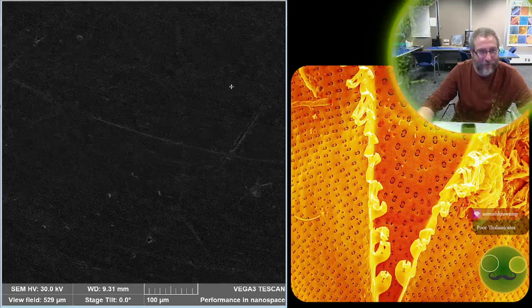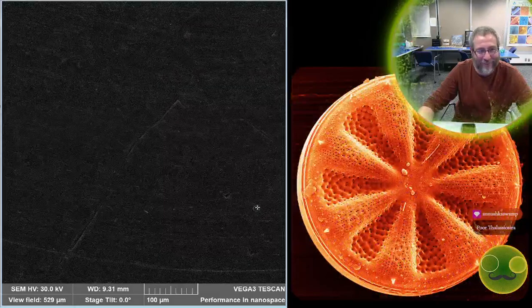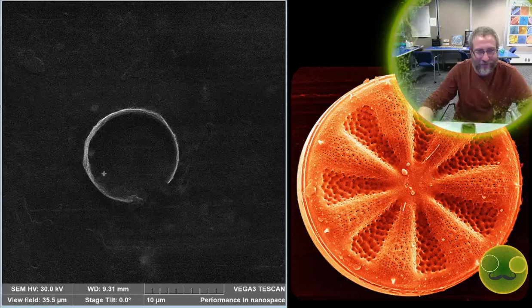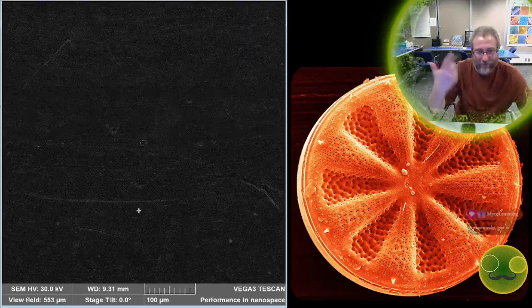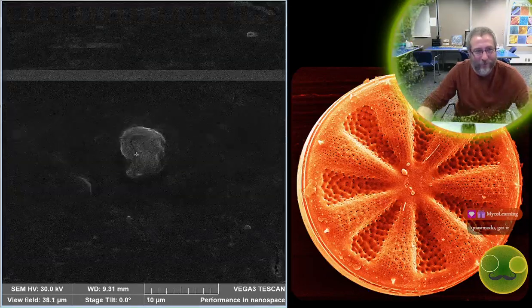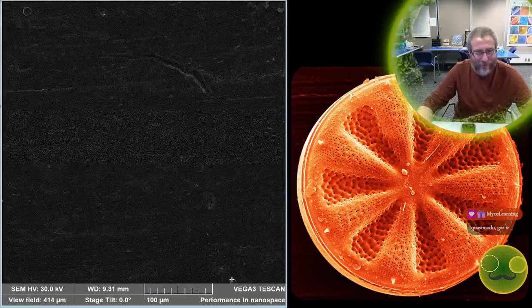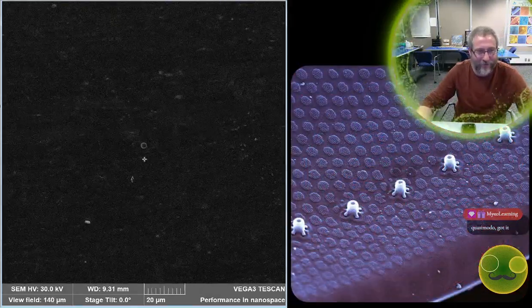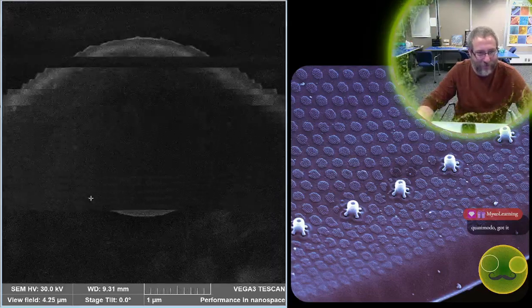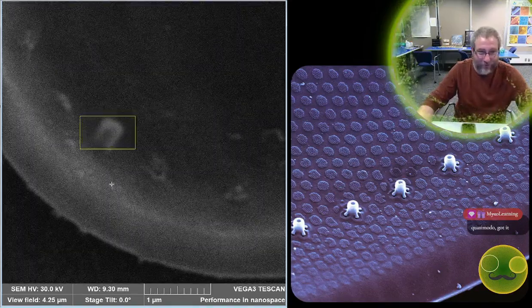Circus freak diatoms are kind of interesting to find, but I don't think that we want to use them to characterize anything. This is just a girdle band, so it's the part that wraps around the outside there. And I saw some other ones when we were looking around on Monday with Andy that had messed up valve faces, where they had a bunch of strutted processes in the wrong place, and I was like, oh boy, that's not what that's supposed to look like. But you have to sort of know what things should look like in order to know what they shouldn't look like, right?